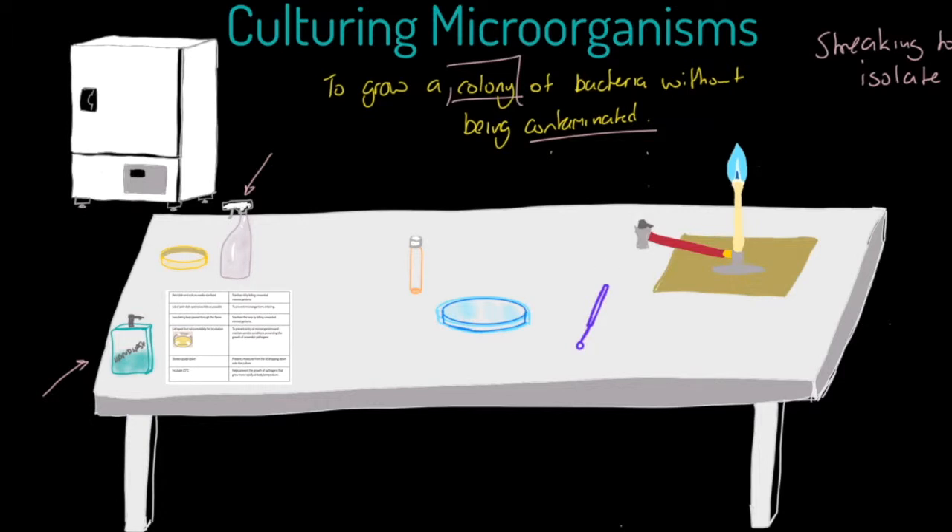Once we've cleaned as needed, we are going to take our inoculating loop, pick it up, take it over to the flame, and place the loop itself in the hot part of the flame.